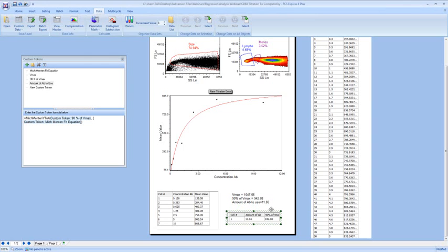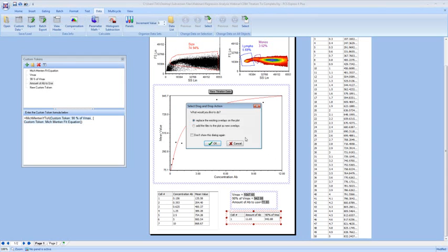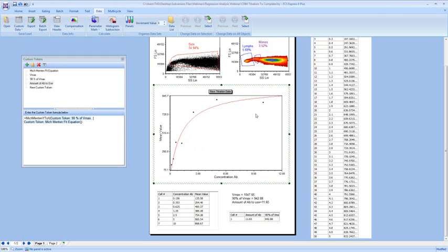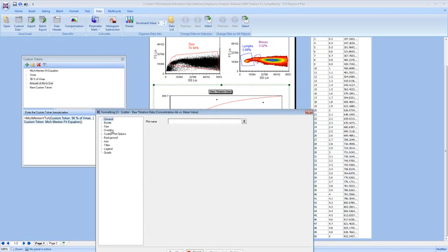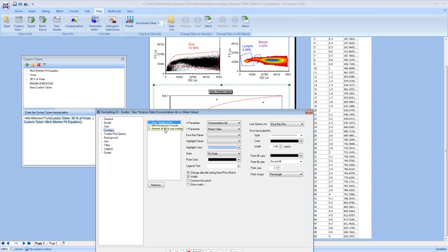We can just drag this onto our scatter plot and add it as a new overlay. And you can see here it's a very, very tiny blue dot. So that's of no use to us, right? We want to be able to really see what that amount is. So let's come to this amount of antibody to use. Let's make this point color bright green.